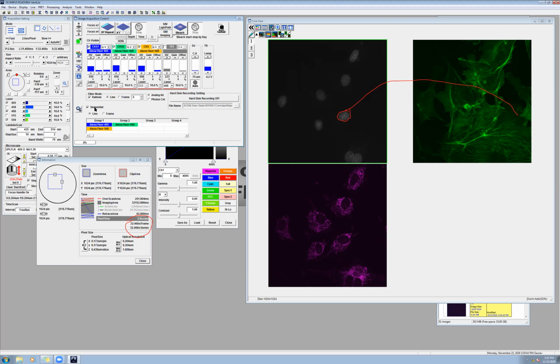Oh, yeah. I was saying, is it always safer to then just put the sequential? Yes, it's always safer to put on the sequential. But if you are getting bored looking at how long it takes for things to scan, you can always play with your settings to see whether acquiring things in non-sequential also gives the same data as sequential. So when you acquire through non-sequential and you get the data wherein there is no crosstalk, then go ahead and do non-sequential, and that will save you some time.